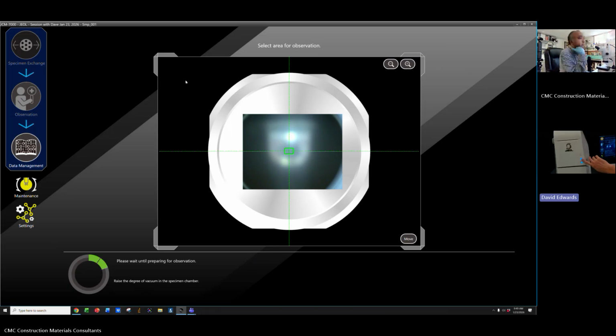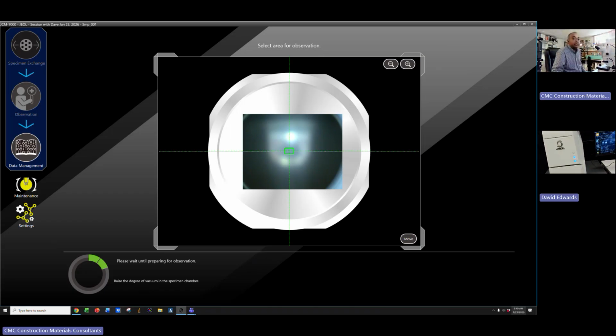There we go. This button right here. I can't see you. Let me see which button you are telling. I have to go back to the team mode.